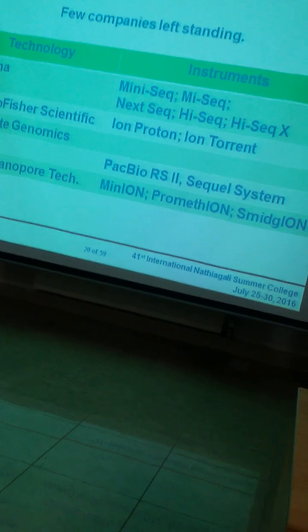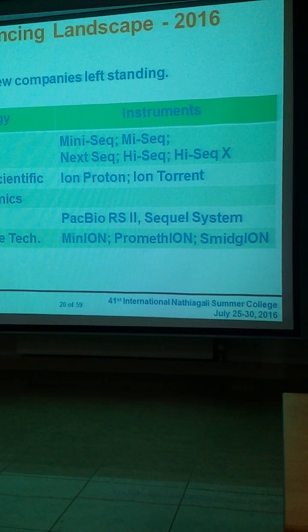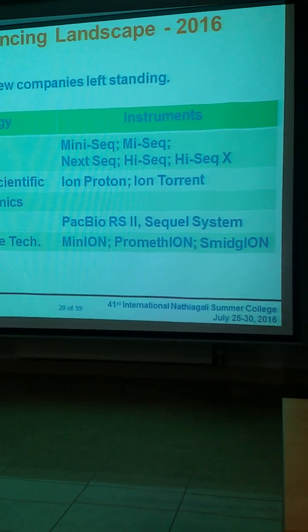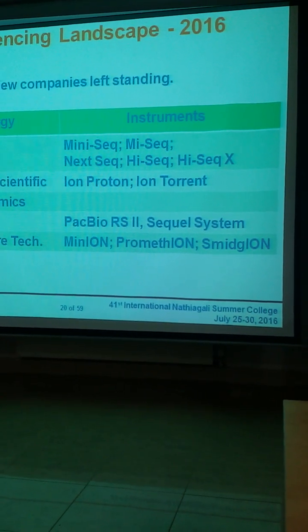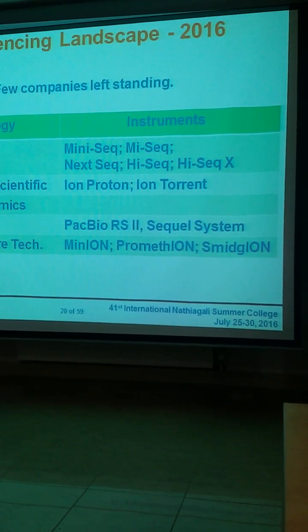Currently at Sanger we have it in research and development, and the error rates we're coming up with are quite high for any useful human genetic and clinical purposes, around 5%. But we're getting some reads which are as long as 100 kb.